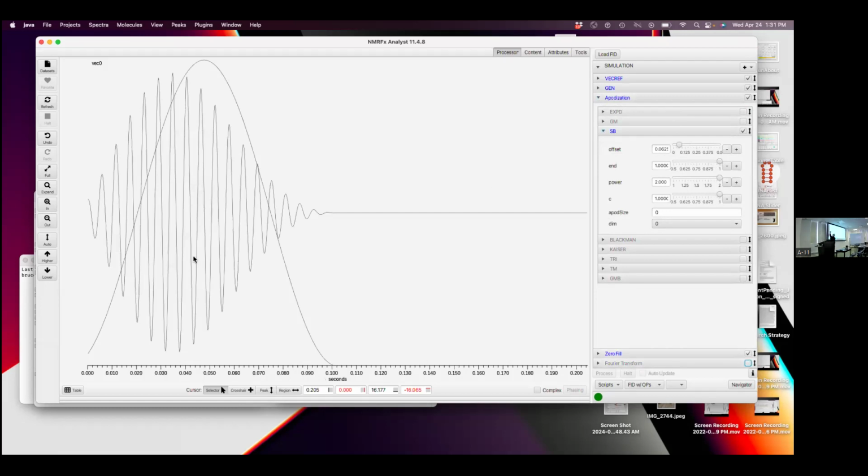I made the signal start small and build up because I used this shaped window that actually starts at 0 and goes up. There are experiments you do that actually have this profile. Basically some COSY, traditional small molecule COSY experiments, will start out with very little signal, and the signal grows and then decays away. In that case, it makes sense to use a window that has a shape similar to the evolution.